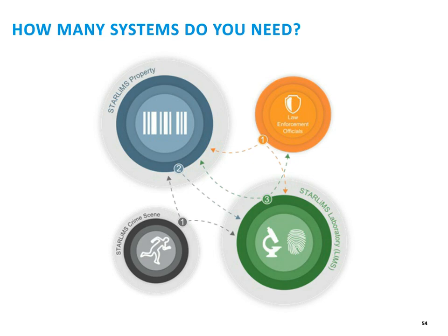Anytime one has to interface two separate systems, even if they're two separate modules from the same company, those interfaces have to be maintained. And if you're dealing with different vendors, you're talking about multiple service contracts, etc. So you want to consider, is there a vendor that I can go with that can provide for more of my needs without having to do these separate modular interfaces? And then the other system that we need to consider on top of all of this is our quality system. Very important. That's the overarching umbrella over everything that we do in forensics.